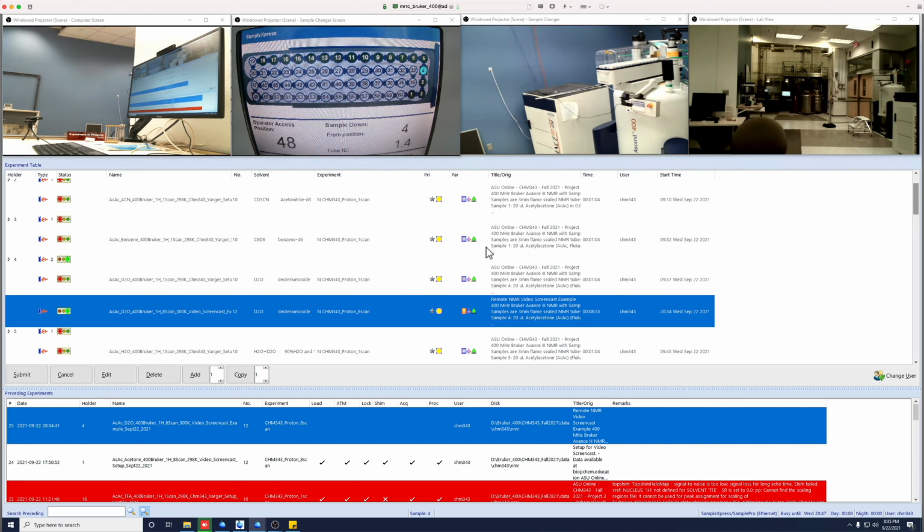So it takes usually several minutes to sometimes several hours to run things, and you can queue as many experiments on as many of the different samples in the auto sampler as you want. So when this data is done, we will have it where it automatically, for class, uploads to the cloud, or for researchers, it uploads to Spectrometer, our cloud service for accessing the data.